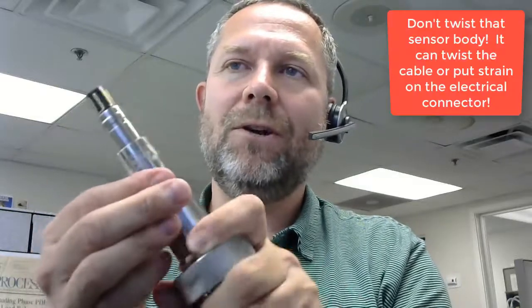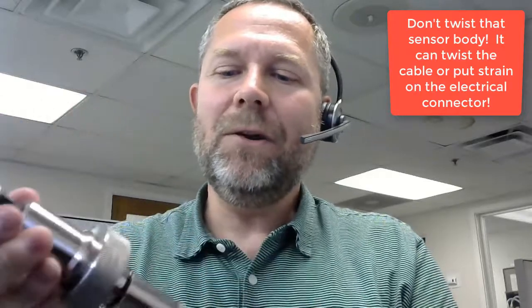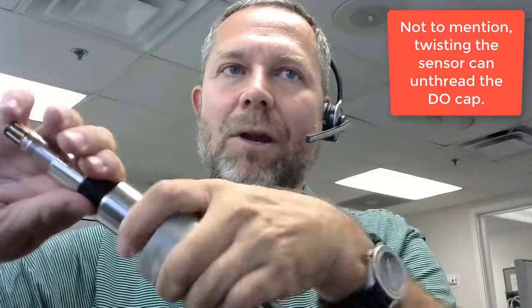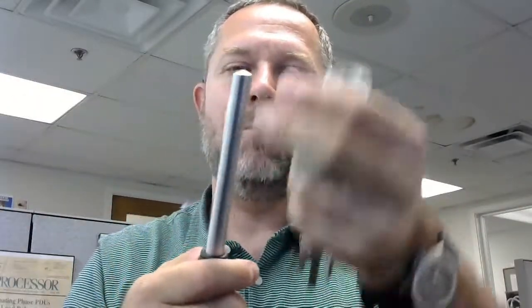You want to make sure that you're twisting the PG-13.5 threads, and not the entire sensor body — this is very important. In this case, I'm threading in a DO sensor. If I unthread this by twisting the entire body, I can unthread the DO cap. So just move the PG-13.5 thread, finger tight, and the cap is not pulled off when you remove it. And that's how it's done.